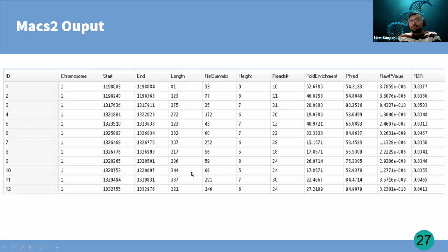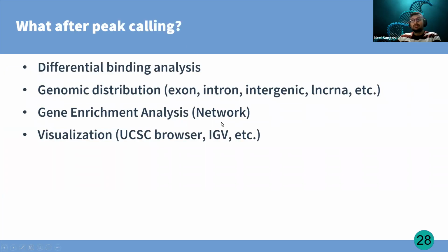Once we have the list of genes, then we will take those genes to build a network to understand what networks are associated with this set of genes. And then we can pick one network out of multiple different networks and study that further. And that could be one hypothesis, right? That this specific network, for example, cell cycle, this set of 20 genes are associated with cell cycle, and they're regulating the cell cycle and controlling this specific gene or this set of genes. And we can build a study on that.